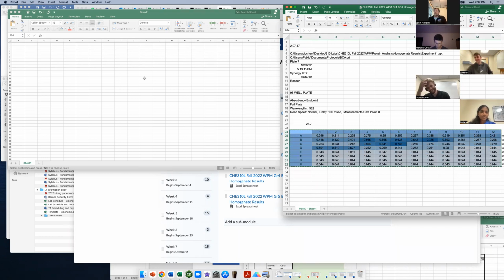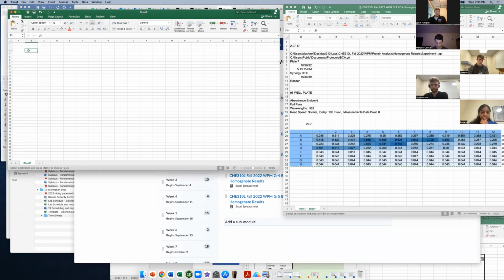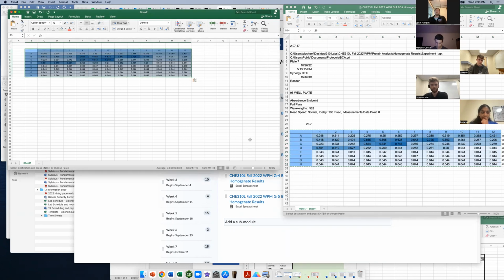Okay, so first thing everyone wants to do, everyone has one of these. So the Tuesday labs that had issues, I've corrected the data and posted it. There's a big old bold thing that says use the data below here. So just use that data. I've fixed things for this afternoon's labs, so everyone can just copy and paste their data.